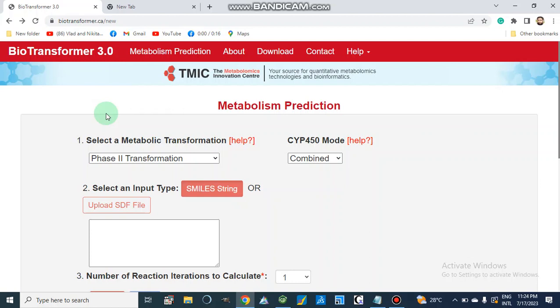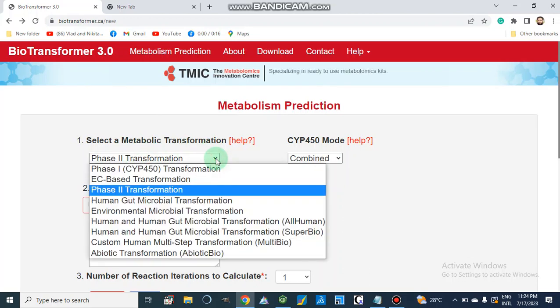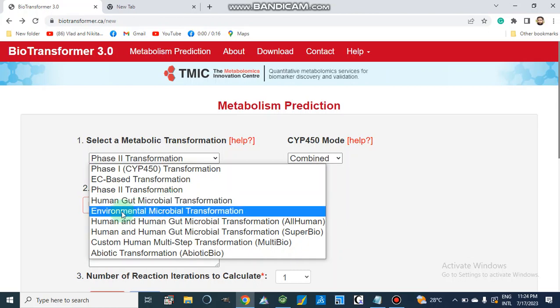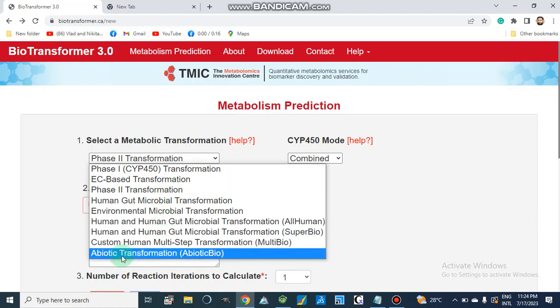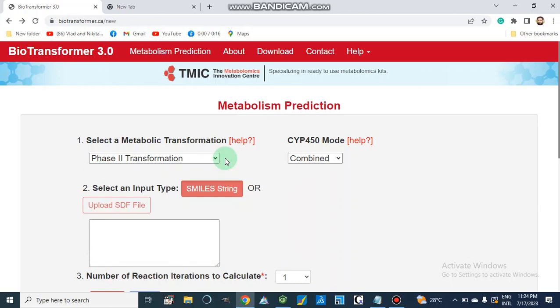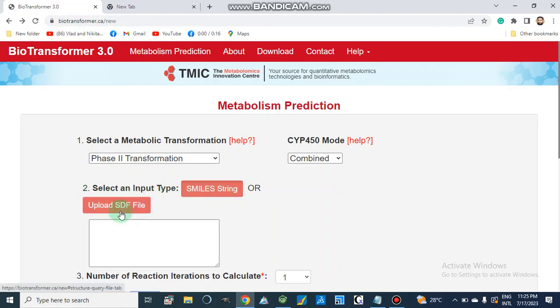BioTransformer 3.0 is an online available tool and it is easily accessible; we can search it on Google. It has different transformation parameters: Phase 1 cytochrome P450 transformation, Phase 2 transformation, human gut microbial transformation, environmental microbe transformation, and abiotic transformation. We can select only one parameter at a time. For input, we can use a SMILES string or upload an SDF file.